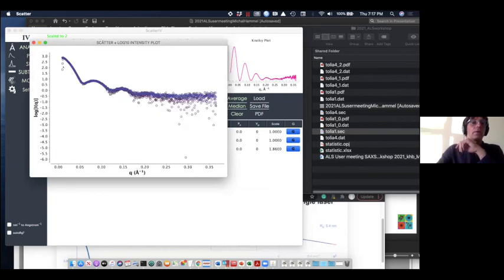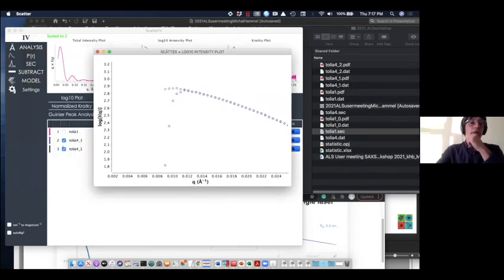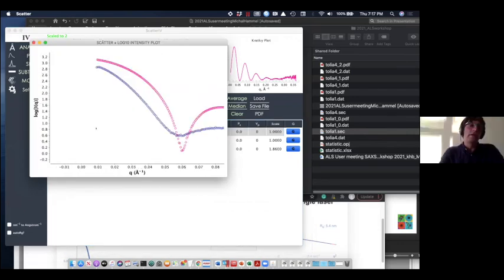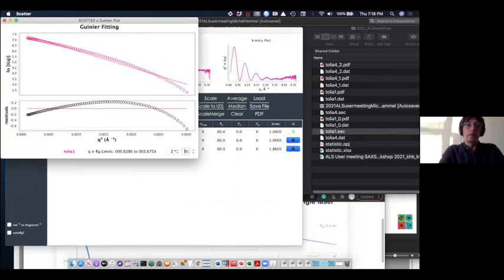So I was wrong. Or I think that was just the buffer construction. So ignore the 2, ignore the 1, or ignore the number 2, and just look at the difference between. And you obviously see the complexation here. You have a different RG.